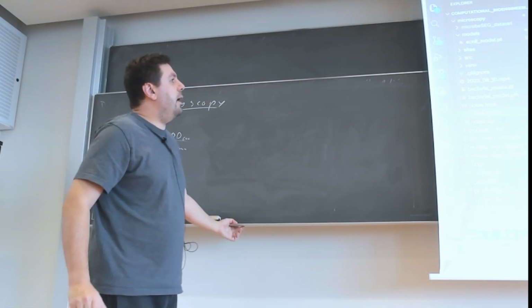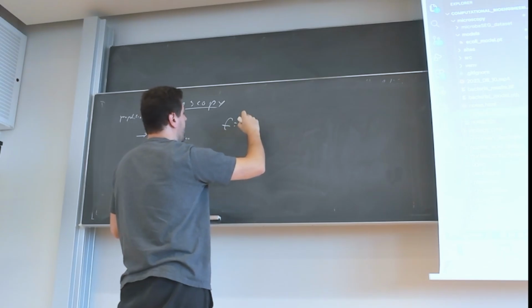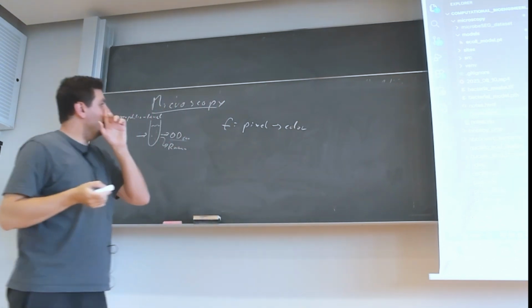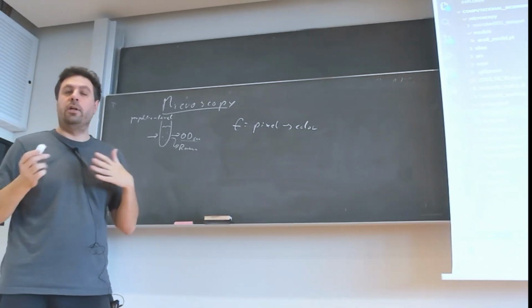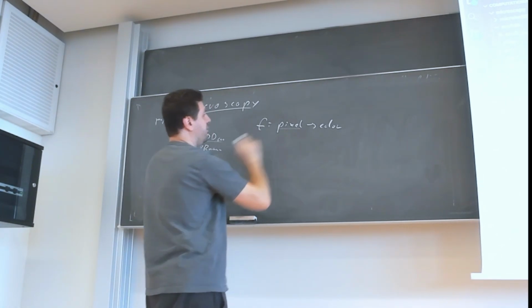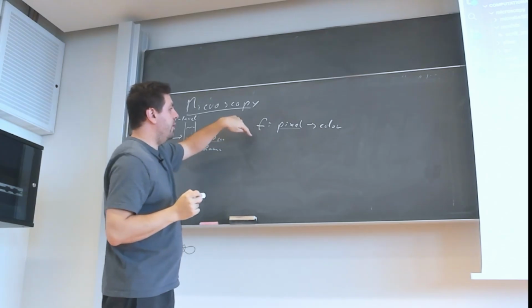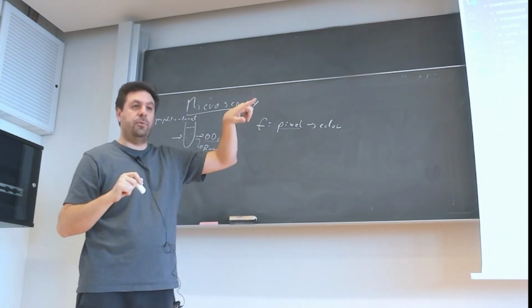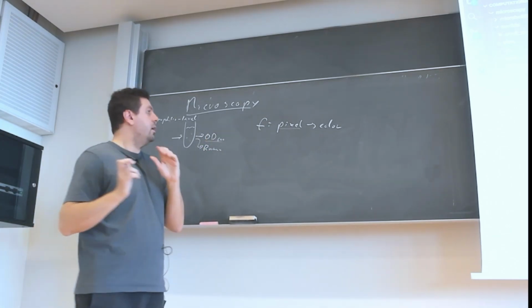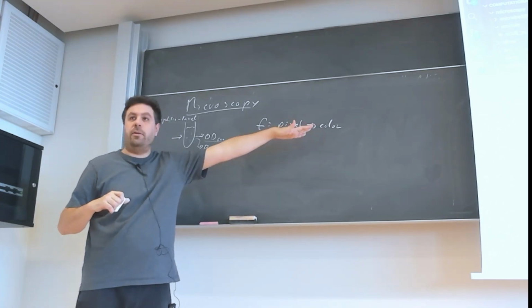An image is essentially a function that maps a pixel to a color. In the particular case of the images we are looking into, these are 2D images. We do not have to address each pixel explicitly by encoding the complete function, but we can fix a traversal of the image from the top left to the bottom right, and just append the colors to a structured list, which will finally be multi-dimensional, but is a sort of list. We append one color after the other, by fixing the traversal.